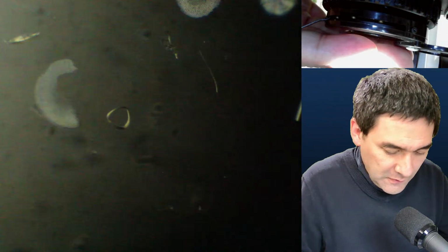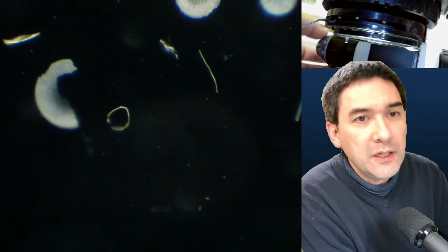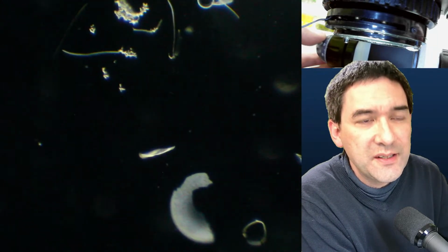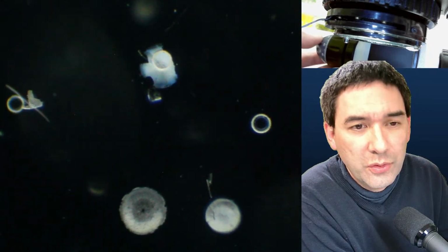You know what I'm going to do again? I'm going to exchange it with, I think it was, let's take again the dark field filter. Fitting it in here is a little bit of a challenge. I think that's the wrong one. That's the wrong one. I use this here. So, yeah. Of course, the contrast is higher. Dark field does have the disadvantage as well that it is very dust sensitive. So any dust or dirt or contaminant in the light path will actually start to shine up.